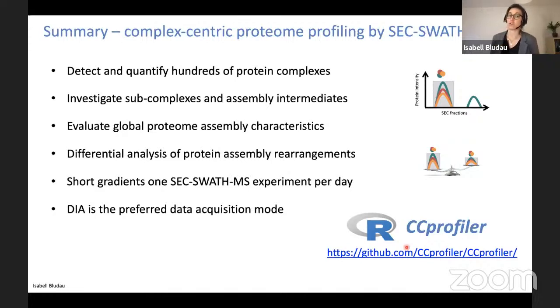So one other option is that, I am usually with DIA starting from peptide level information, but you can also use CC profiler beginning from proteins directly. So this might be more optimal for using DDA, because you kind of get rid of problems of single peptides being missing in some samples. And by starting from the proteins directly, this could be easier.